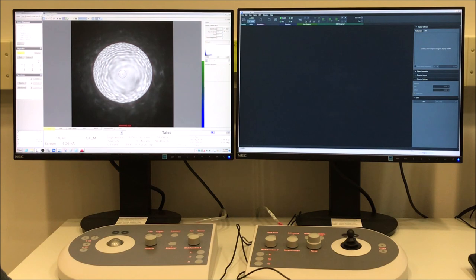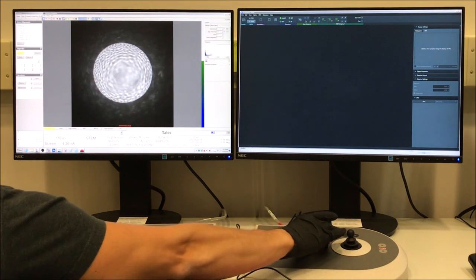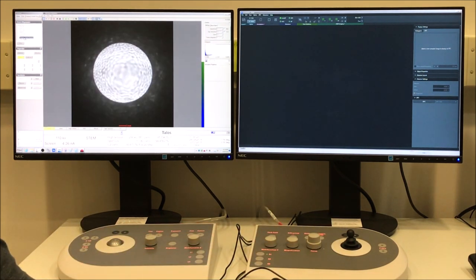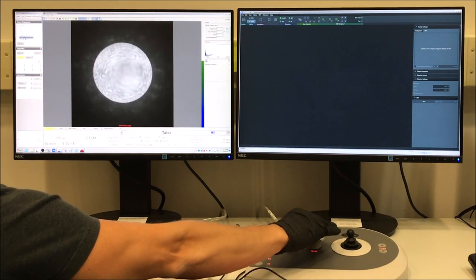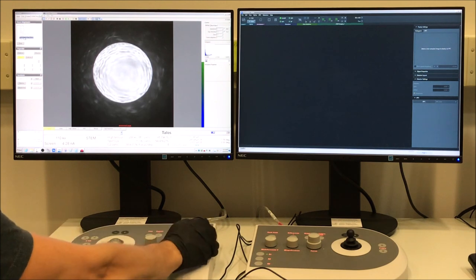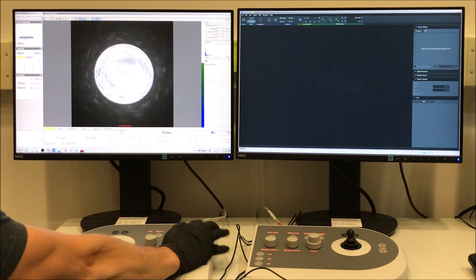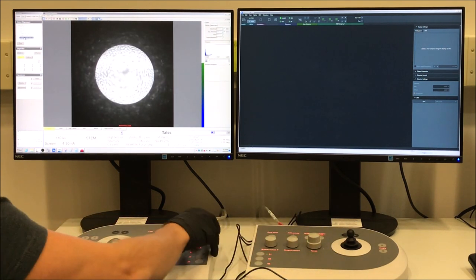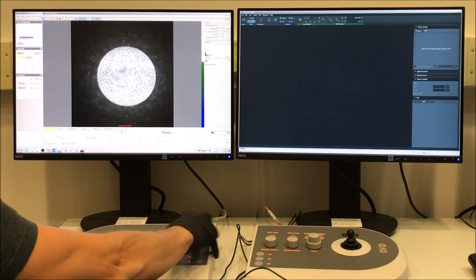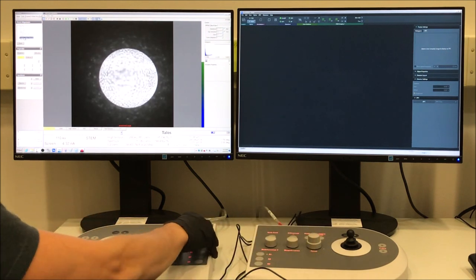I'm also going to turn off those recognition marks or centering marks on the flu cam just to make this a little easier. And then the next step is the rotation center intensity alignment in direct alignments. You can see as I'm pulsing the focus, the Ronchigram is not expanding concentrically. So now I'm using my multifunction knobs. I bottomed out the sensitivity, just hit that minus button above the left knob a few times. Okay, so I made it worse. It's expanding up into the left.